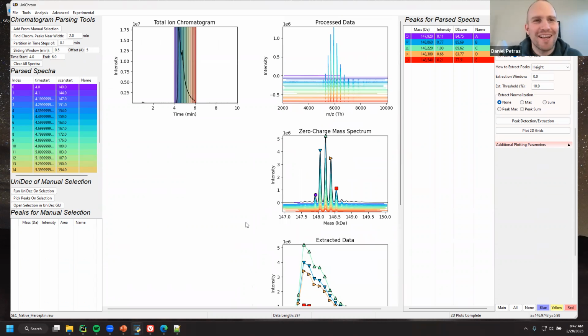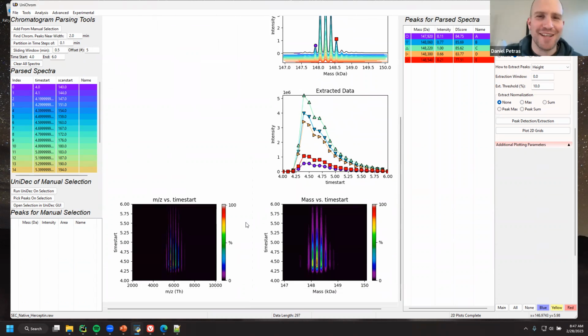That is super cool. Can I ask you something about the SEC, as this is something I'm also getting more and more interested in? How does it perform with mixtures? If you would have a bunch of proteins, did you use that before? How's your experience there? I'm trying to think. I definitely have looked at some data sets like that. It does work, and it should work well. It depends, of course, on how crazy your data gets.